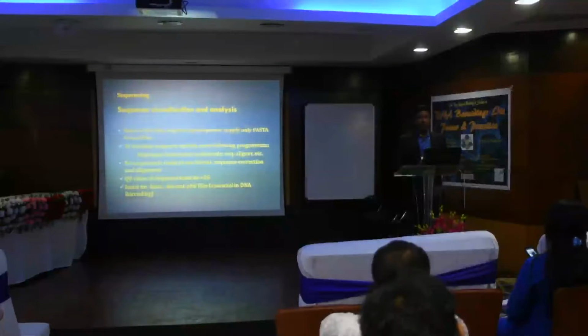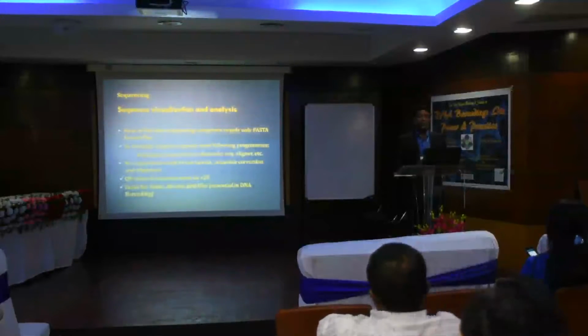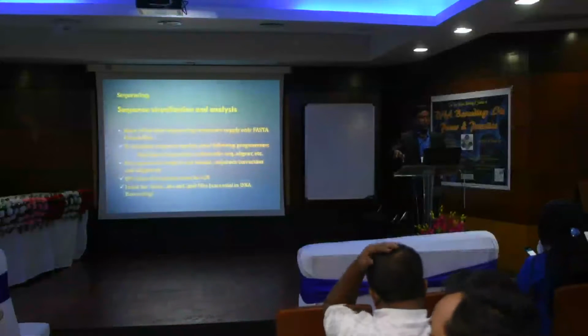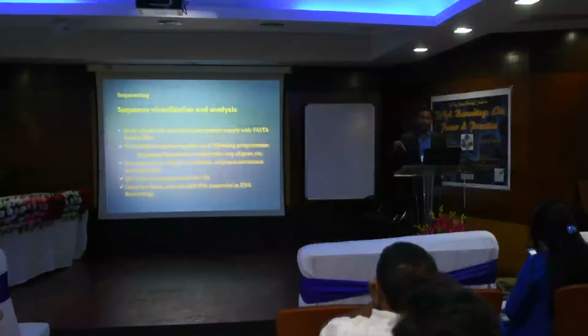We lost one machine that way. It was imbalanced and was never repaired by the company. Many imported machines are used in biotech labs, and repair is always worse than buying a new machine. So respect your machines in the biotech lab. Don't play with them. Don't stop the rotor by hand. It is a very bad practice. If your machine is not automated, no student should stop it by hand, and you will do a lot of damage to your machine.